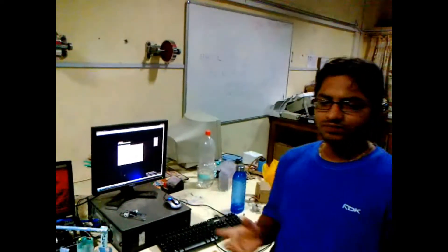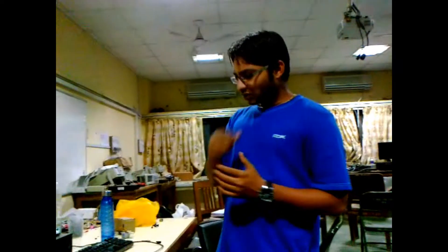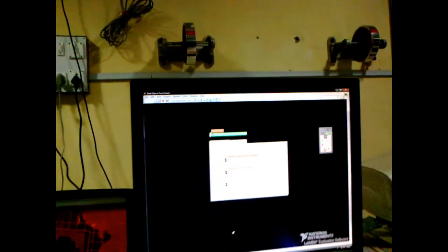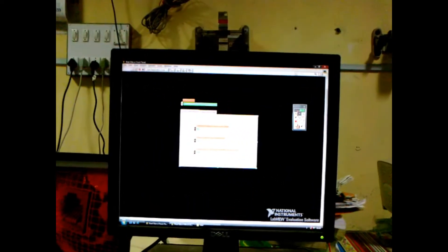SILAR stands for Successive Ionic Layer Adsorption and Reaction. We have used a program based on LabVIEW. We have automated this whole setup and the programming is done on the software LabVIEW, provided by National Instruments. Here you can see on the screen the front panel of LabVIEW, where we have used a tab control.